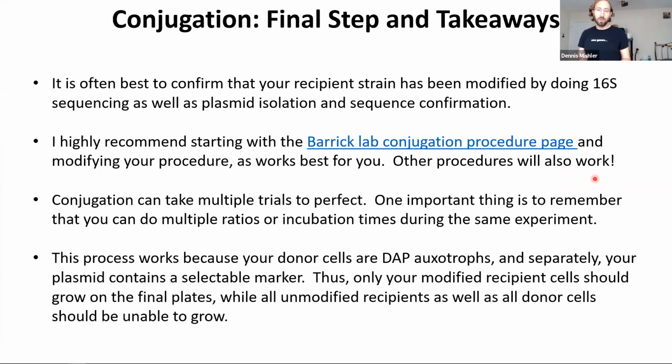If you're working with somebody who uses a different procedure, use their procedure. This applies to any experiment. If somebody you're working with is an advisor and a mentor, and they use a different procedure, use theirs unless theirs is not working. They're going to be able to help you a lot more than I can help you with using my procedure. If you talk to me about how to work with this procedure, I'll tell you what I would do, but your reagents may be different. You might be doing a slightly different experiment or have a different type of DNA sequence, and it may be difficult for me to help you troubleshoot that procedure.